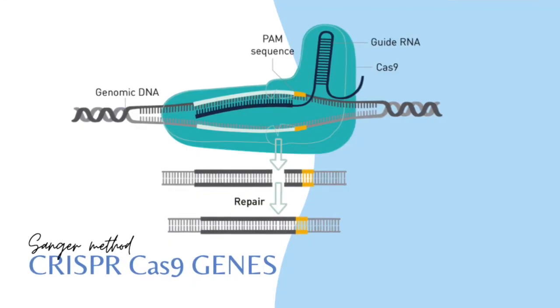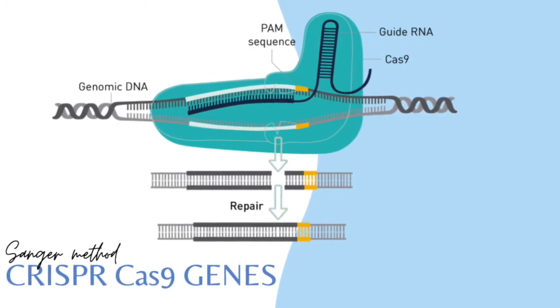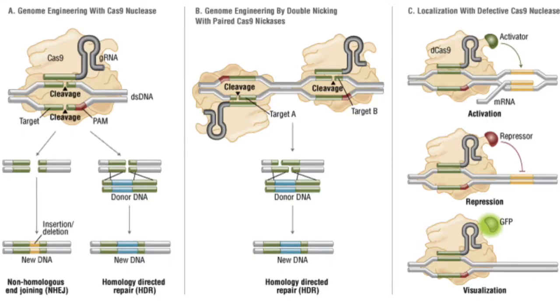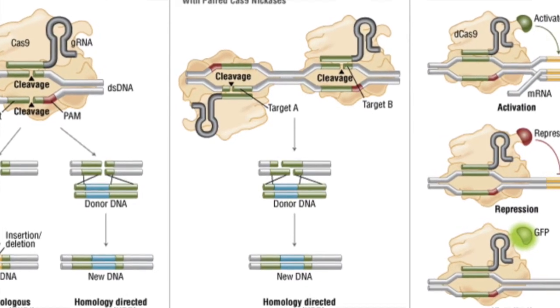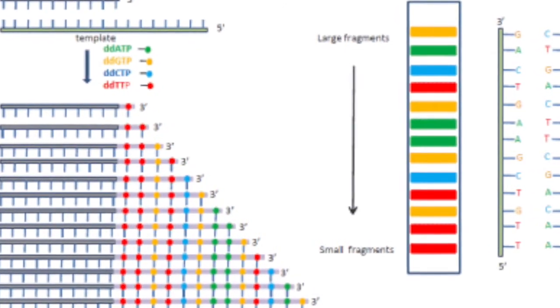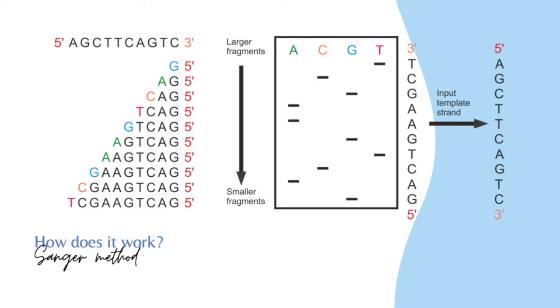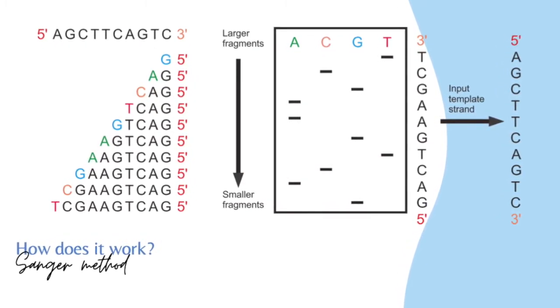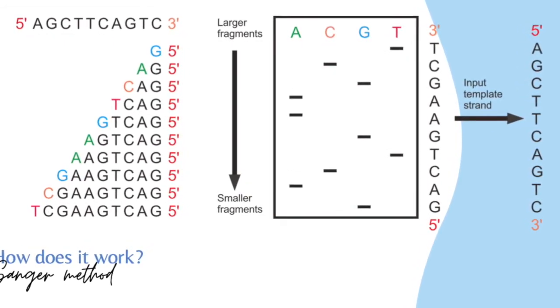Sanger sequencing is also used in the validation of CRISPR-Cas9 genes. The CRISPR and the TALEN editing techniques largely allow specific genomic modifications, since the repair process is not completely accurate in genome editing and fragment analysis. Here, Sanger sequencing is used to determine the efficiency of CRISPR-mediated genome editing. This sequencing is very valuable as it is very accurate in a simple and cost-effective workflow. In fragment analysis, it can detect insertions and deletions quickly.